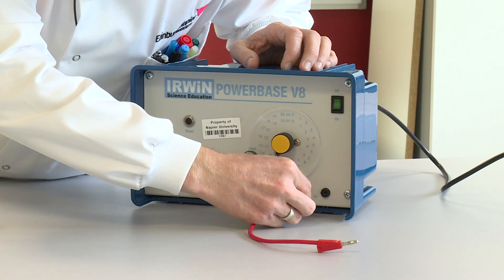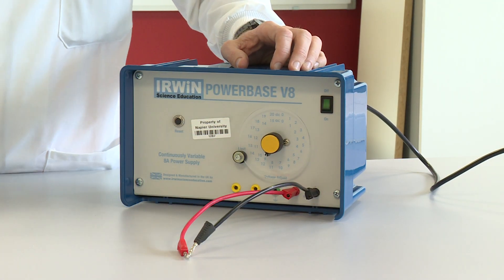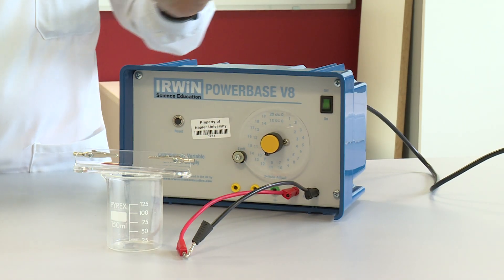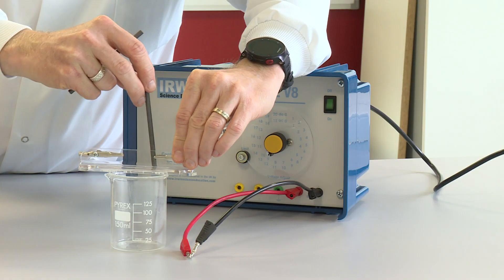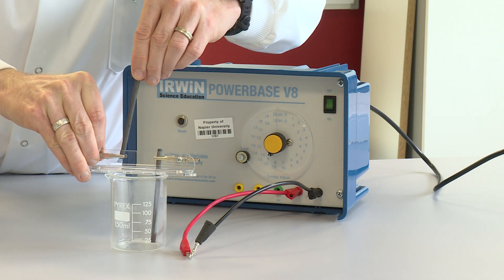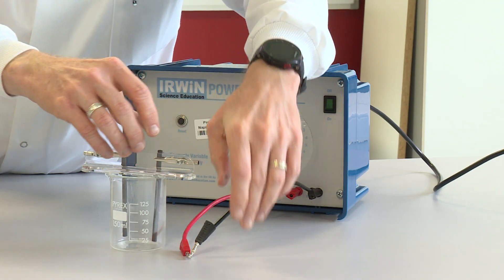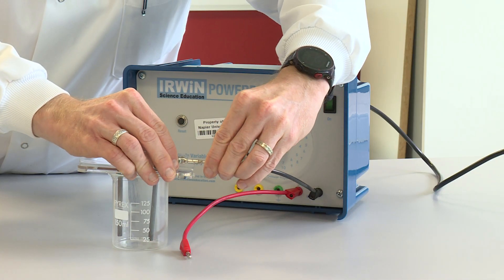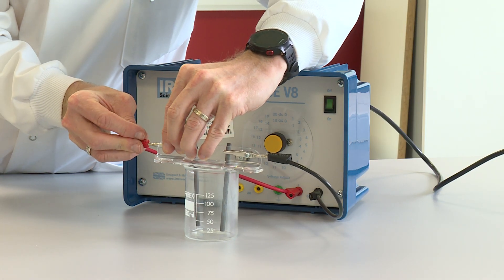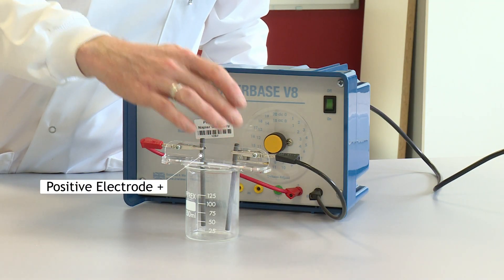I'm going to put one wire into the red socket of the DC supply and another wire into the black socket of the DC supply. I've got my electrode holder which is going to sit on top of the beaker, and I've got my carbon electrodes that I'm going to hold in place with the crocodile clips. The black wire is attached to the negative terminal and the red wire to the positive terminal, so this is my positive electrode and this is my negative electrode.